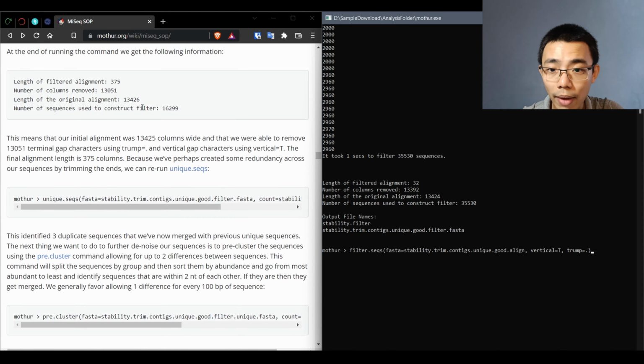Okay, so actually I just have to make contig. Because I did not run this just now, I suspect this might be the problem. And just for sanity, I'm going to run make contig and then screen sequences again, just to make sure that this thing definitely did not exist. Let's see if it works. So I do have 16,000 sequences. Okay, so I do not have the long sequences, so I'm correct. Let's run the unique sequencing.